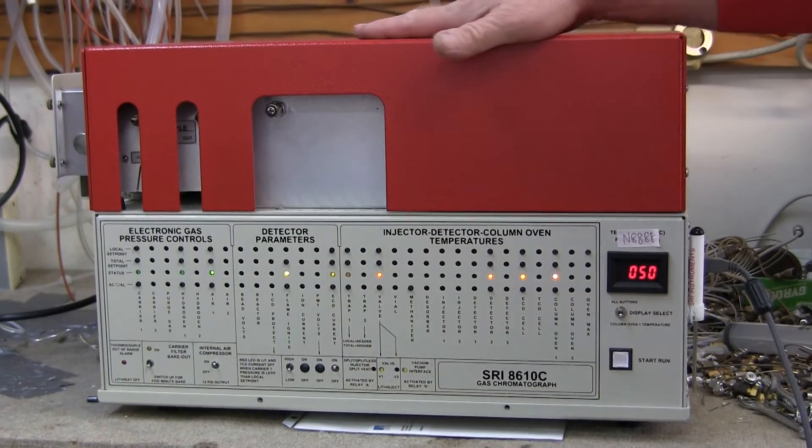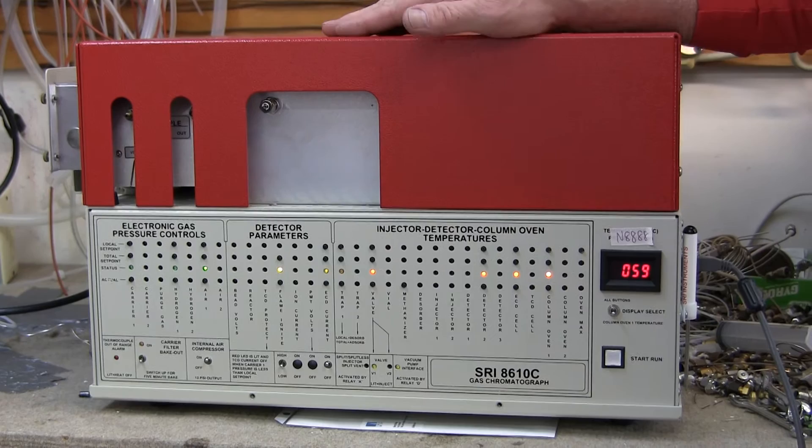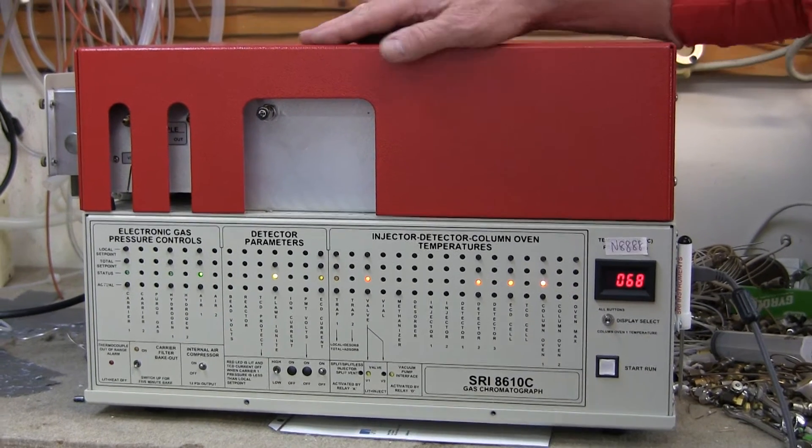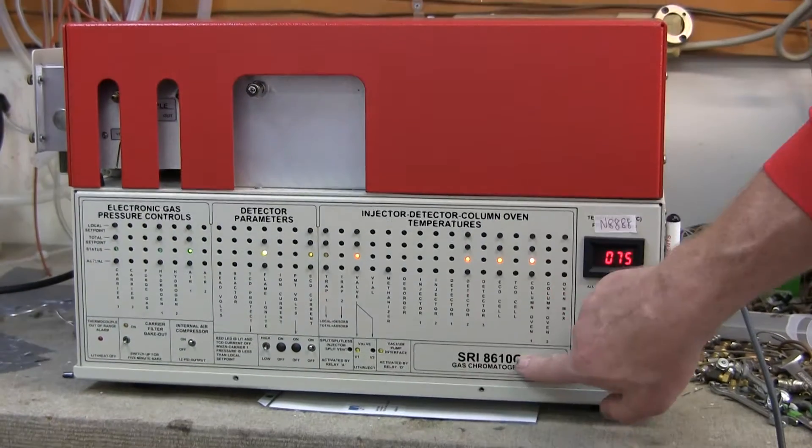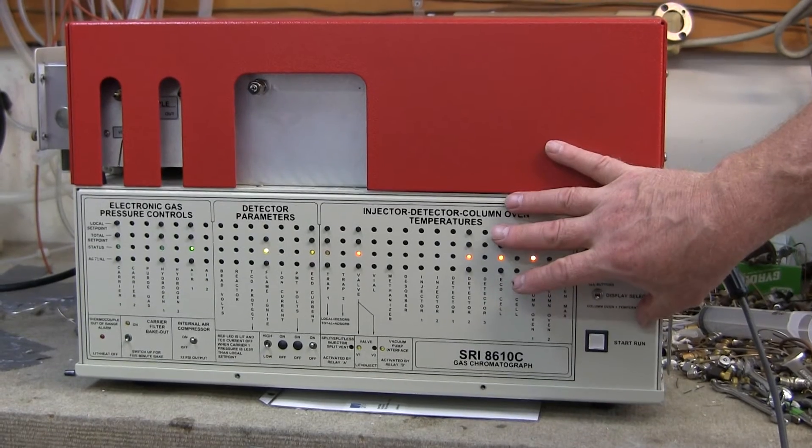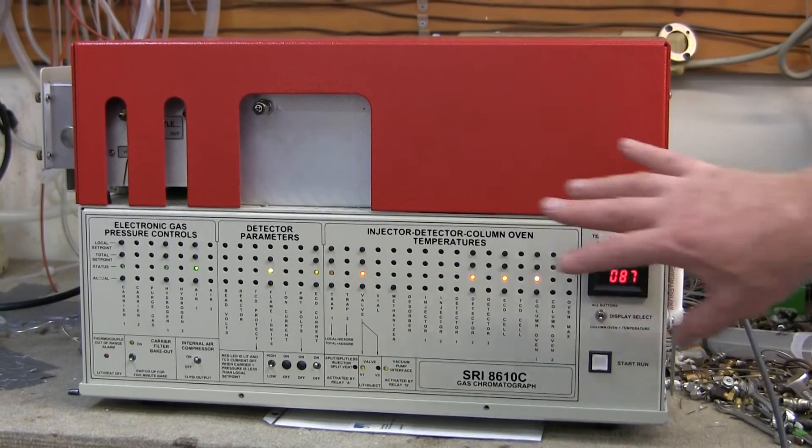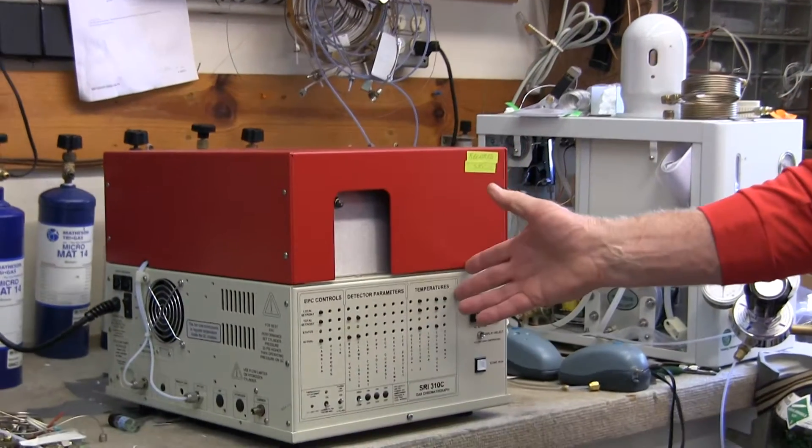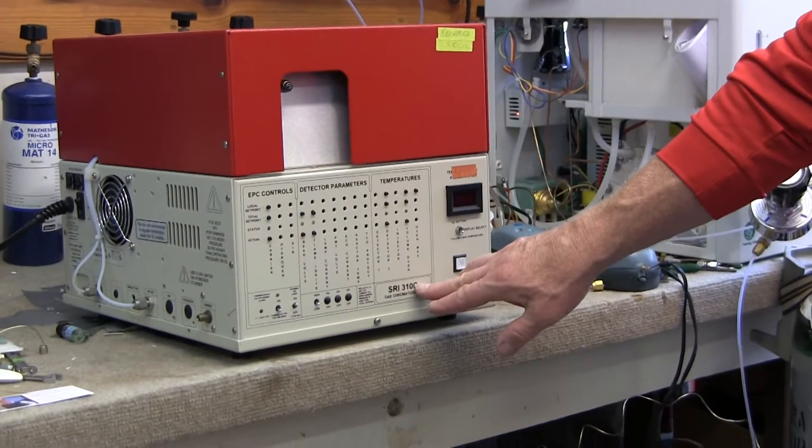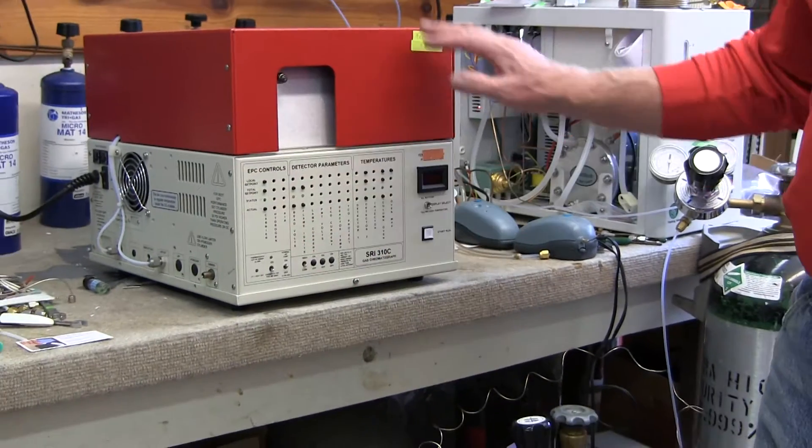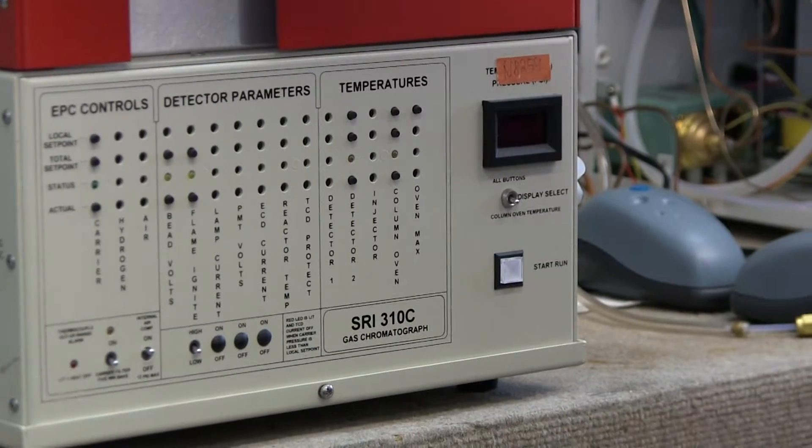All right, this is the SRI model 8610C GC. The model number really just refers to the size of the box. If you had a model 310, like this GC over here, it's really all the same. The model number refers to the size of the box that all the parts are mounted in.